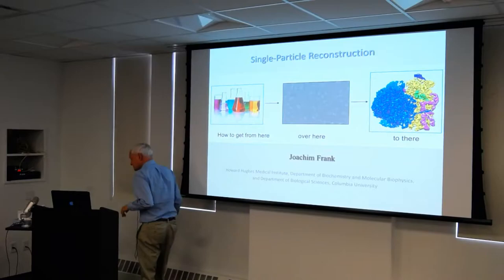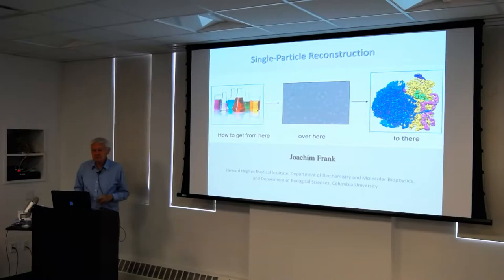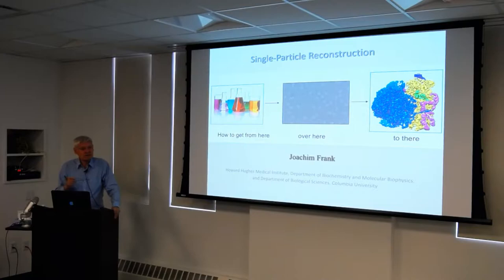So I just wanted to tell you how we can get solution structures of molecules, single particles. It's called single particle reconstruction, not Cryo-EM, because initially all these algorithms were developed completely without cryo. Cryo sort of merged later on. Okay, so I think you've already got some of the concepts in earlier lectures, so there might be some overlap. I apologize, I just didn't know what already happened.